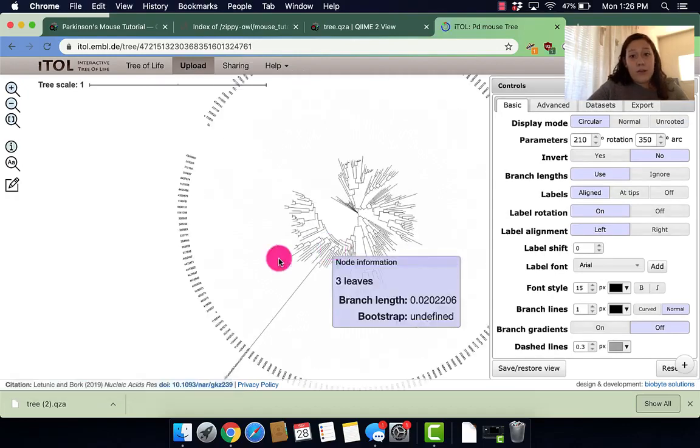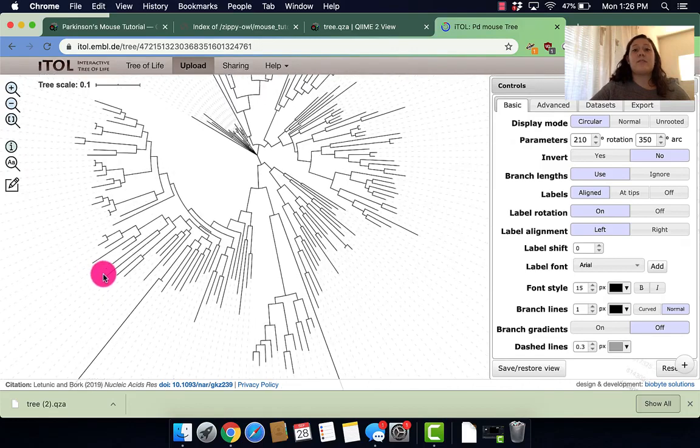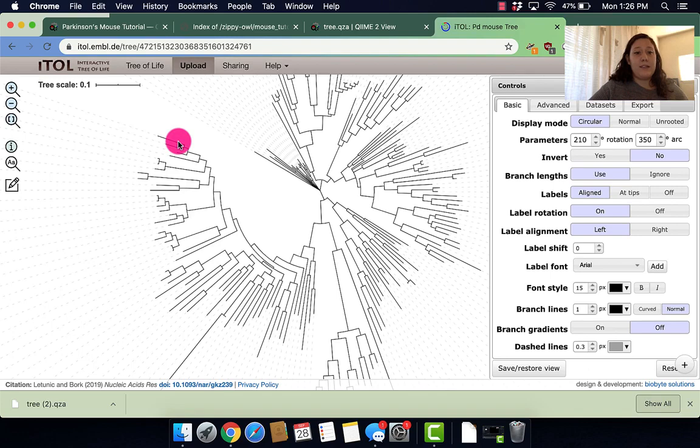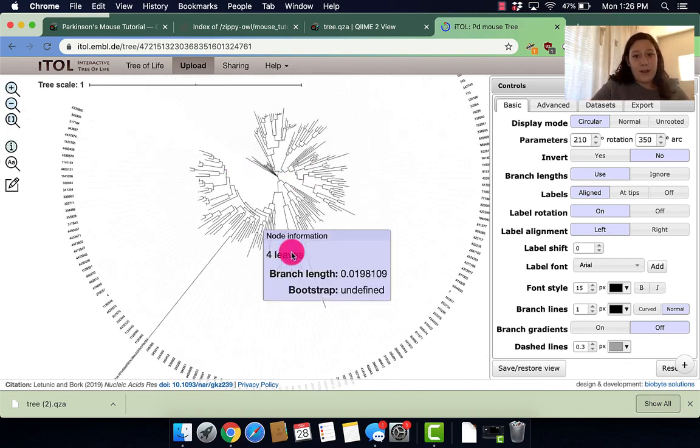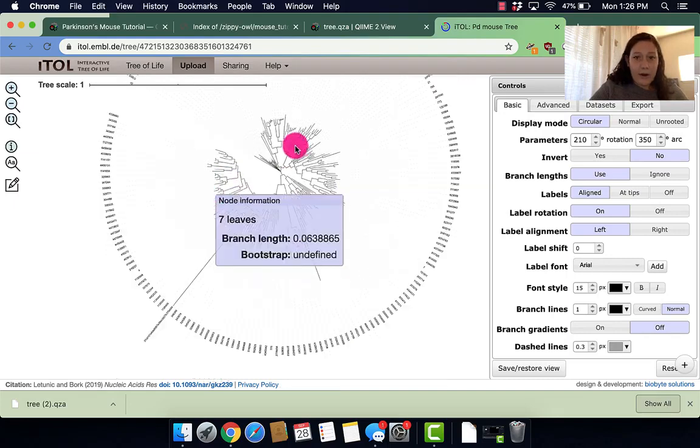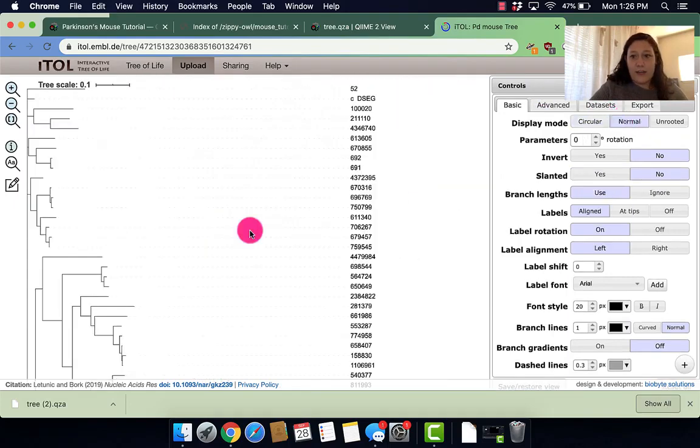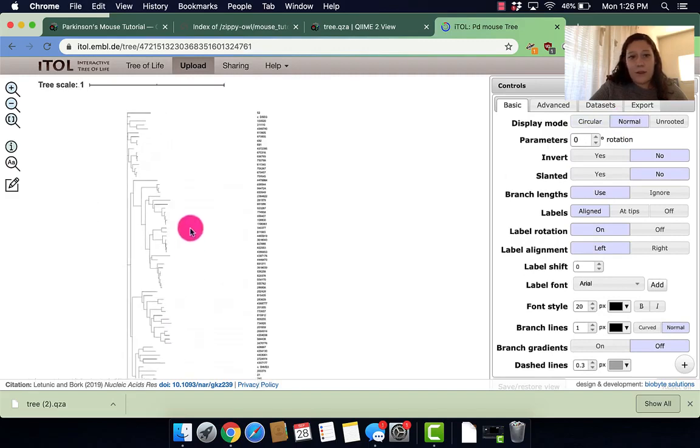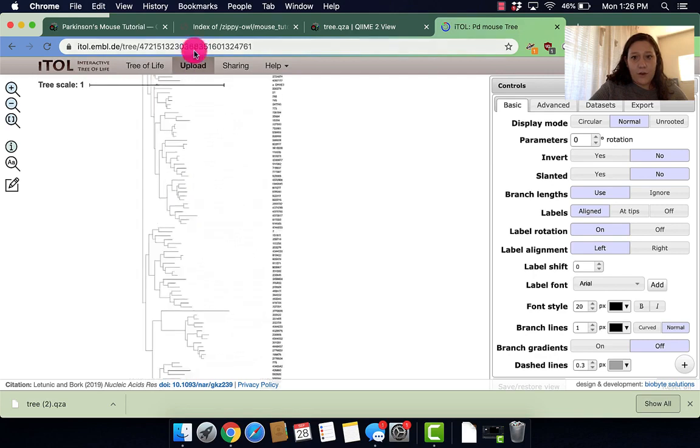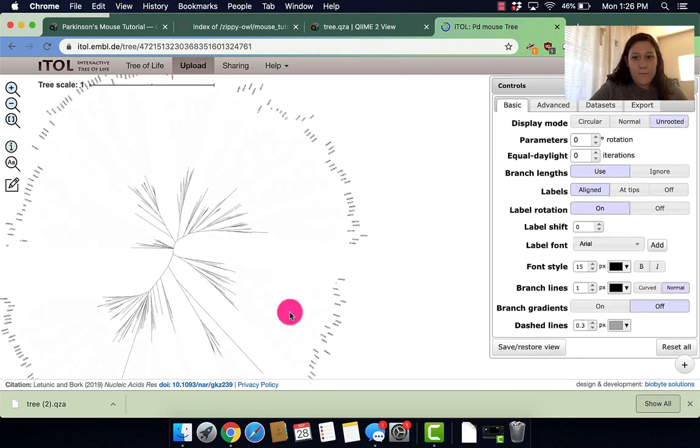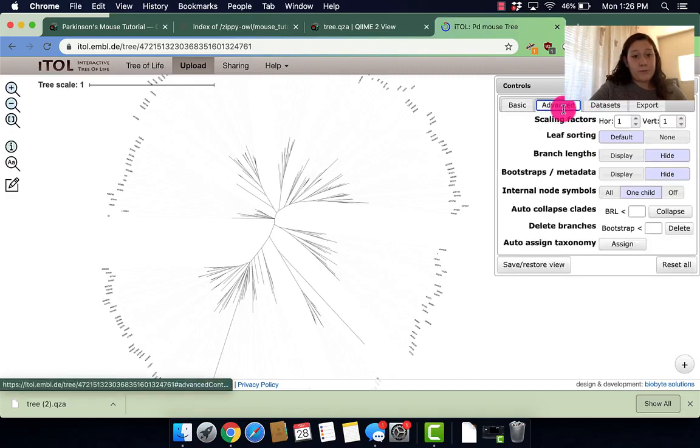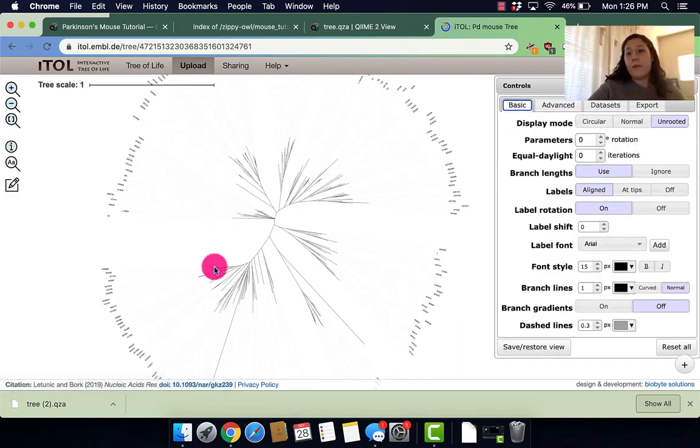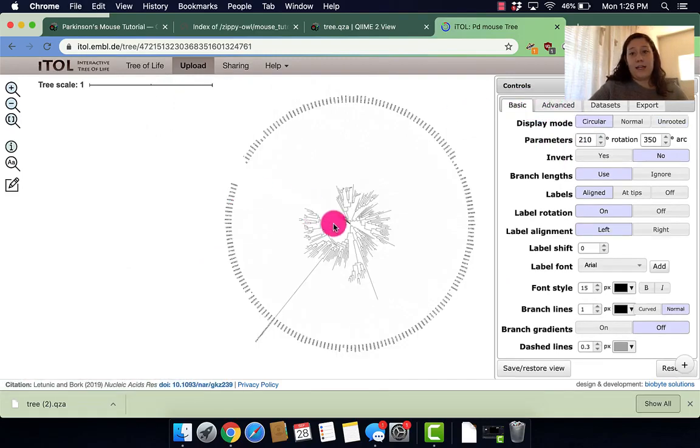So here it is. So again, this isn't a particularly informative tree because it's not really for us to interpret that much. It's for QIIME to interpret, but we can kind of see how our phylogenetic tree looks like. We can also look at it in long form or normal form or unrooted. It just kind of gives us a look at what our phylogenetic tree looks like.